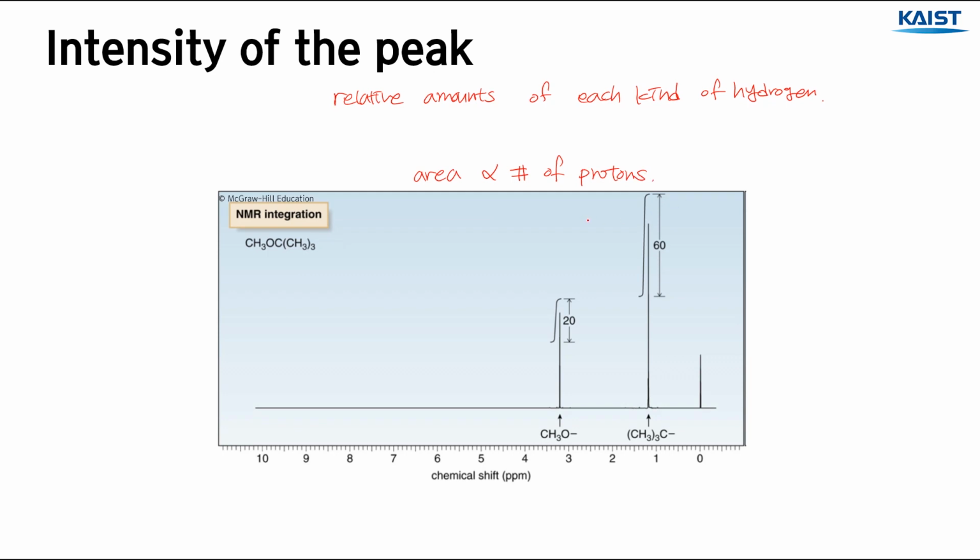An NMR spectrometer can integrate the area under the peaks, and modern spectrometers can even automatically calculate and plot the value of each integral in arbitrary units. The ratio of integrals means the ratio of absorbing protons in a spectrum. Be careful that this only gives a ratio, not the absolute number of protons.